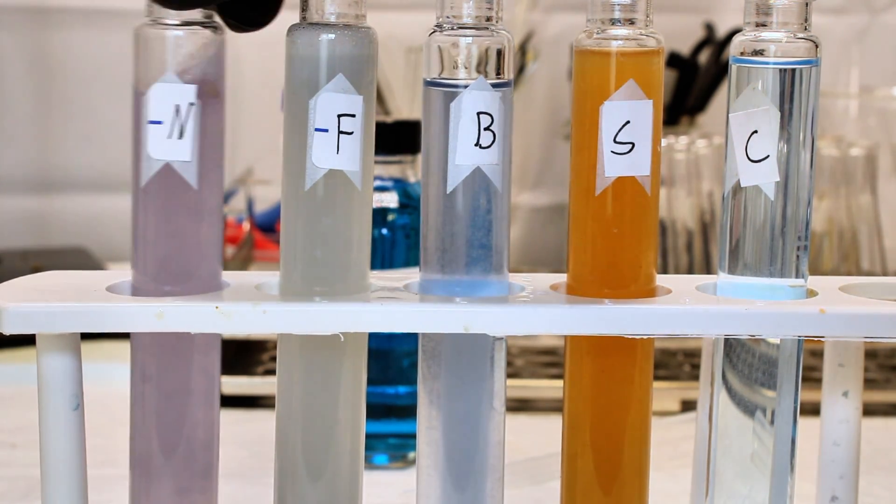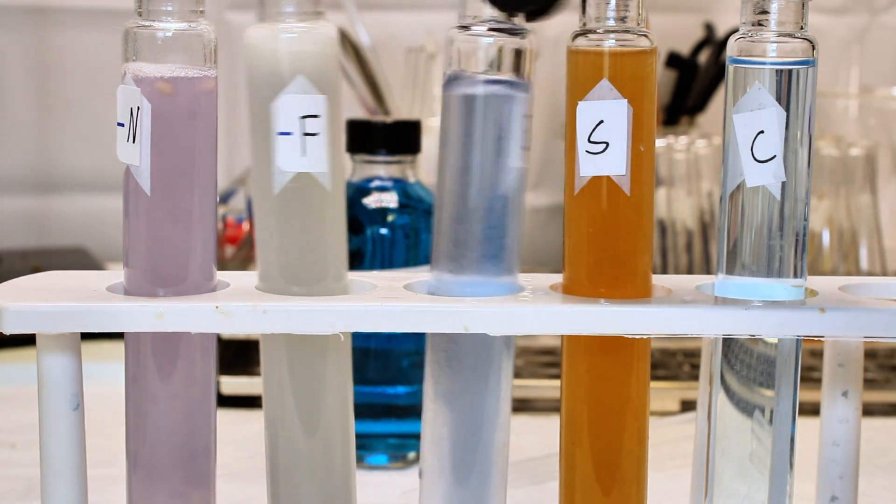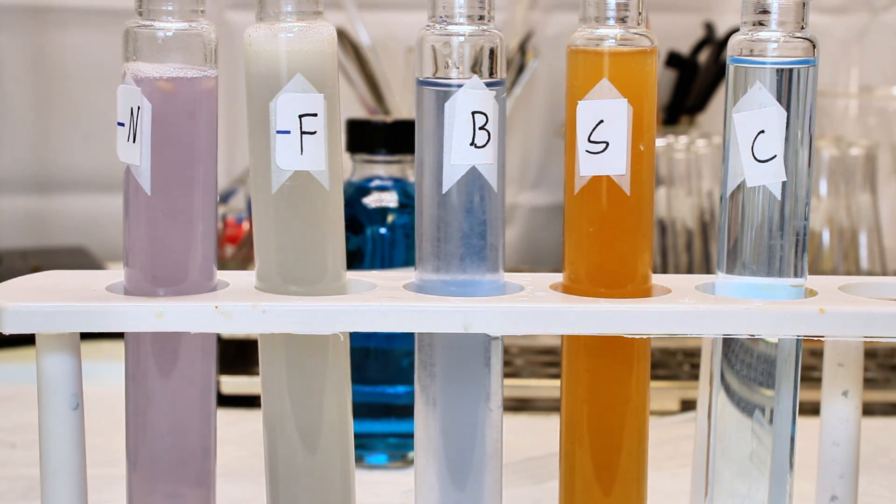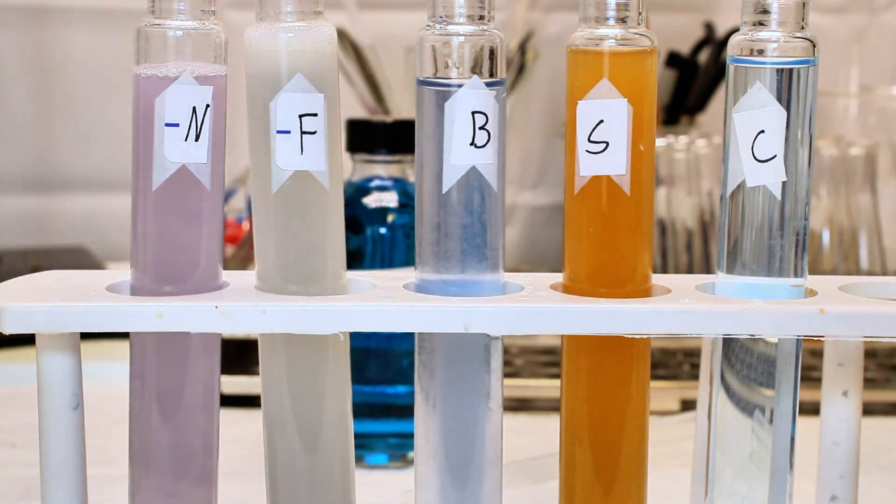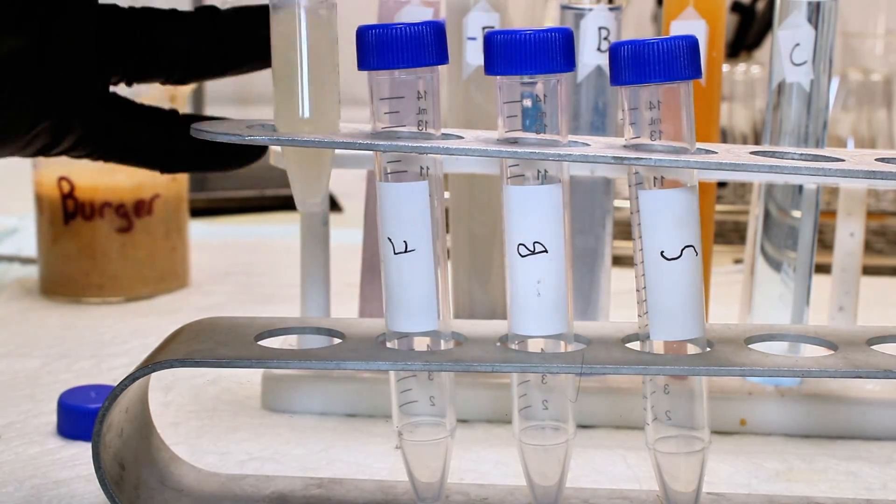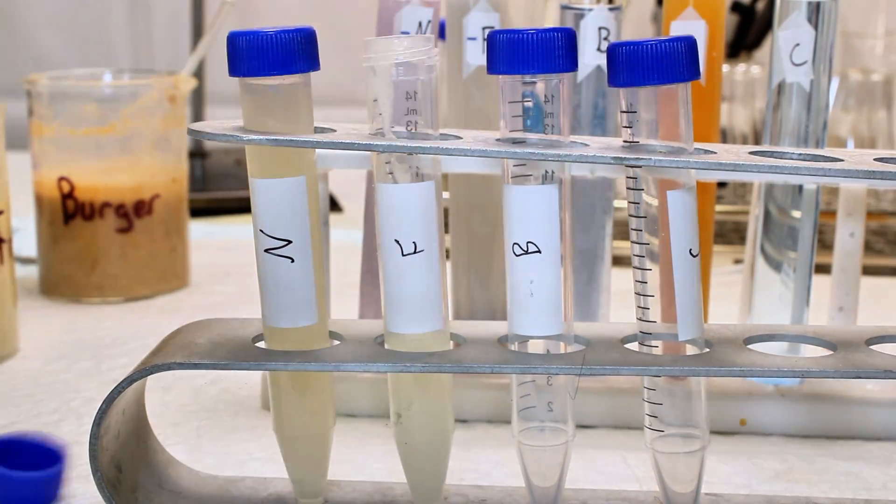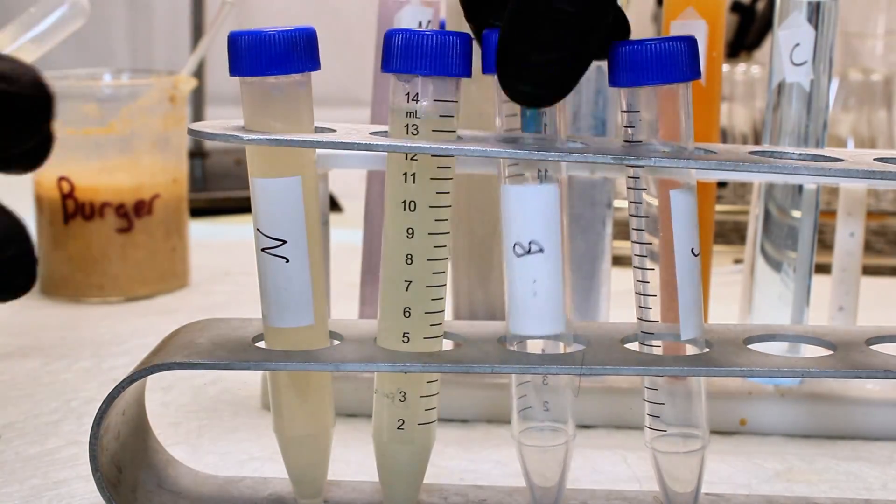The fries clearly tested negative for protein, as did the sauce, but the burger was really tough to read. To try and get a clearer result, I added a small amount of sodium chloride to the samples here, sonicated them in hot water at 55 degrees Celsius for 30 minutes, and then centrifuged to try and force all the sediment that was obstructing my view to the bottom.